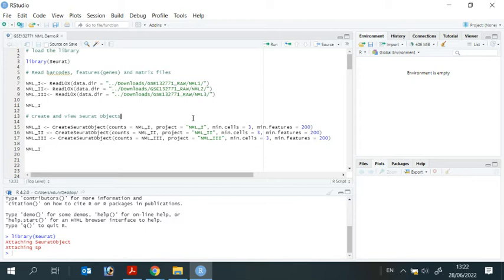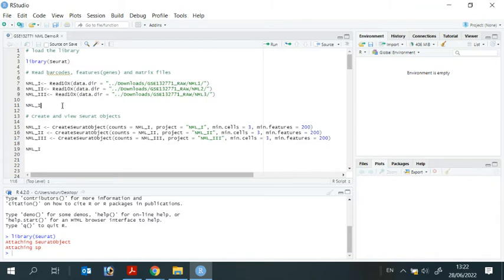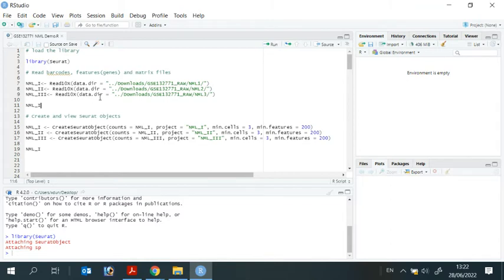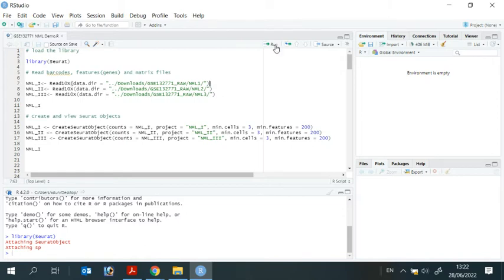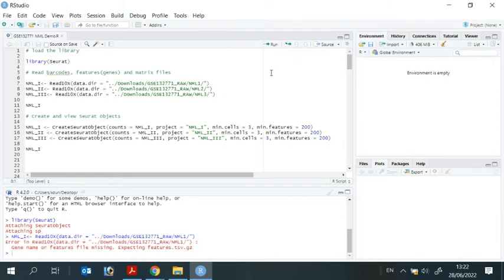Now we can use the Read10X function to read the data into R. We also give each repeat a name as nml1, nml2, and nml3. The data directory tells R where we store the downloaded files. Let's run the first repeat. You can see, we got an error down here.